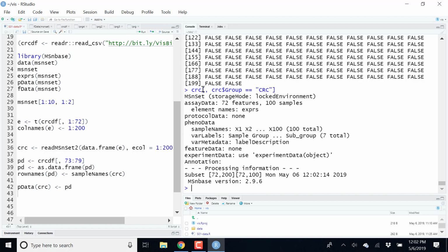So we're going to use different data sets throughout the course. And these will either be in these data containers, for proteomics, microarray or transcriptomics data sets. And sometimes these will be in the long format or maybe in the wide format. And depending on what we want to do, we will need to be able to convert them from one to another.